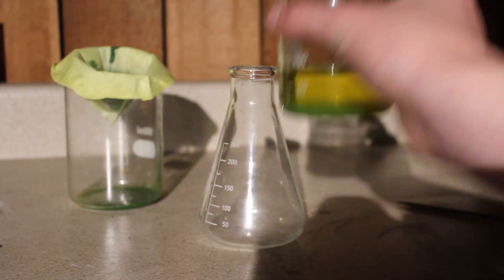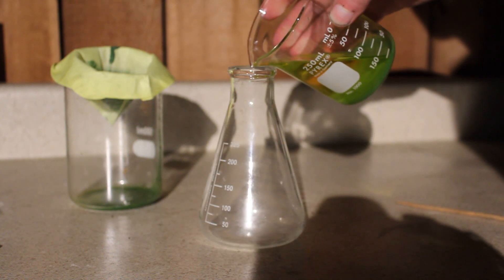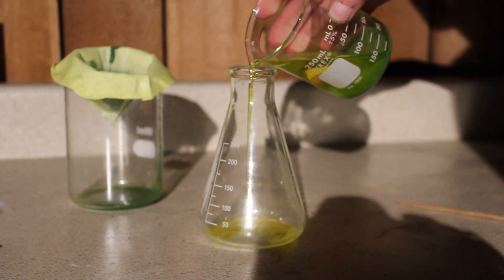I let the filtered solution sit for a couple of hours to let all of the fine particles settle out, and then I decanted the solution to another container.